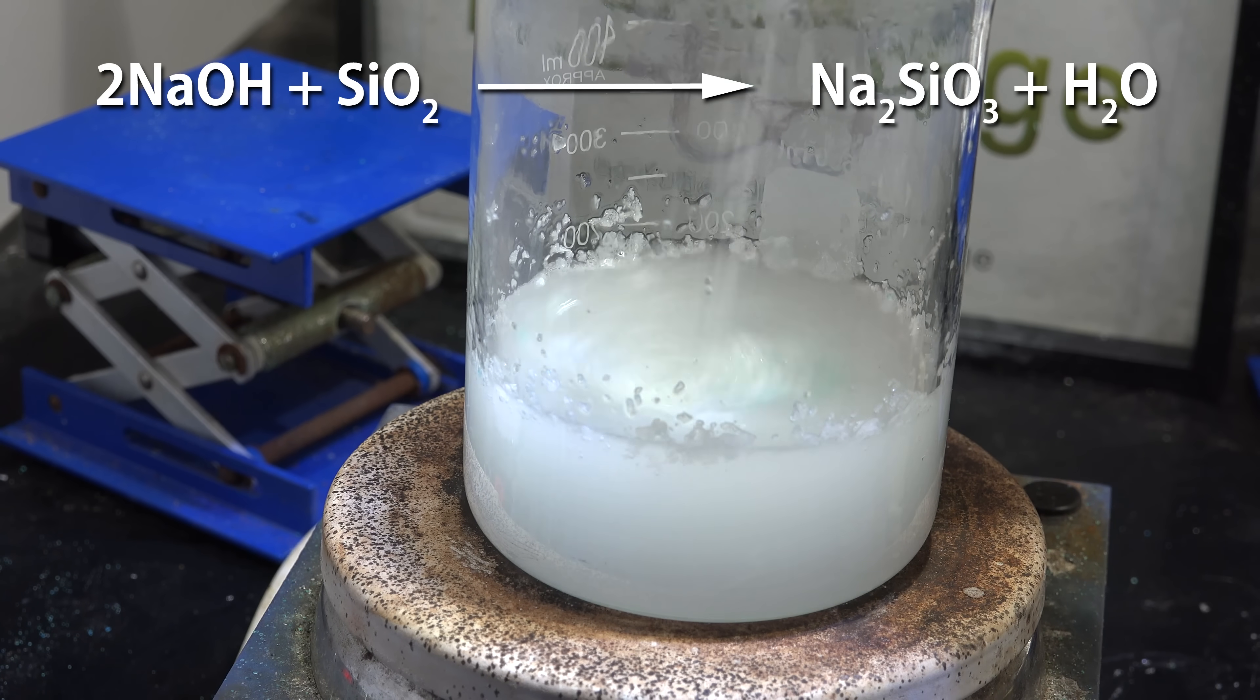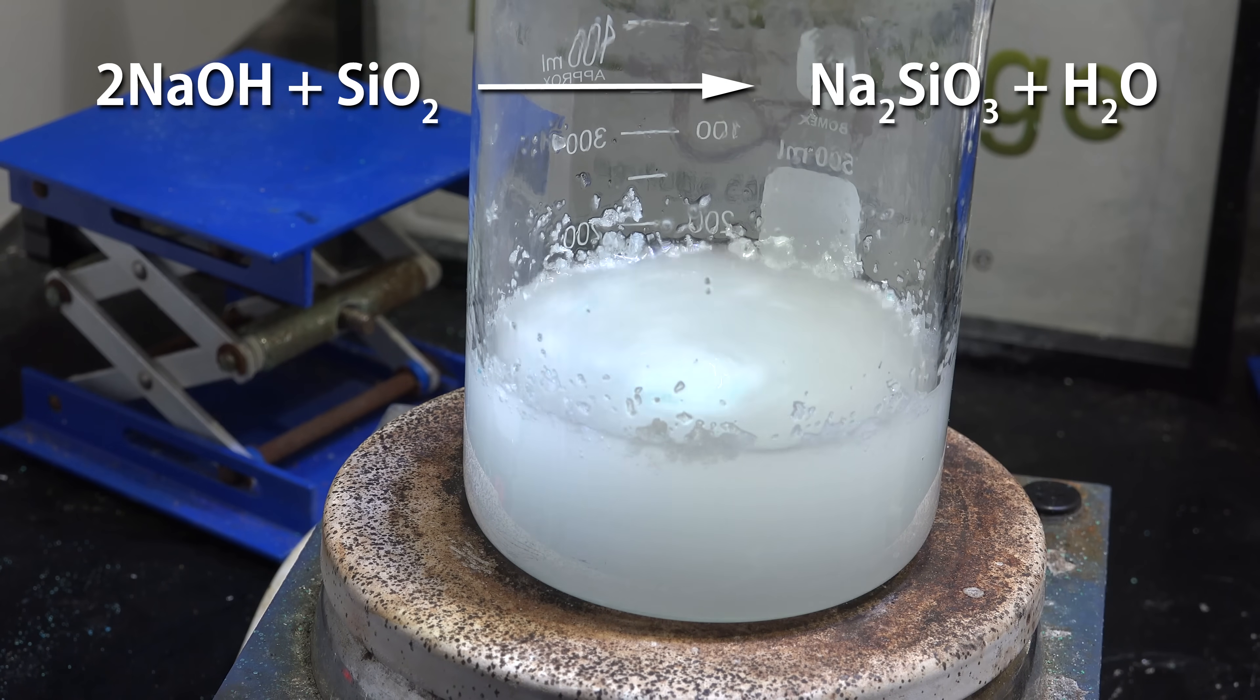Now the ratio I'm using of two moles of sodium hydroxide and one mole of silica produces the classic sodium silicate formula known as sodium metasilicate.